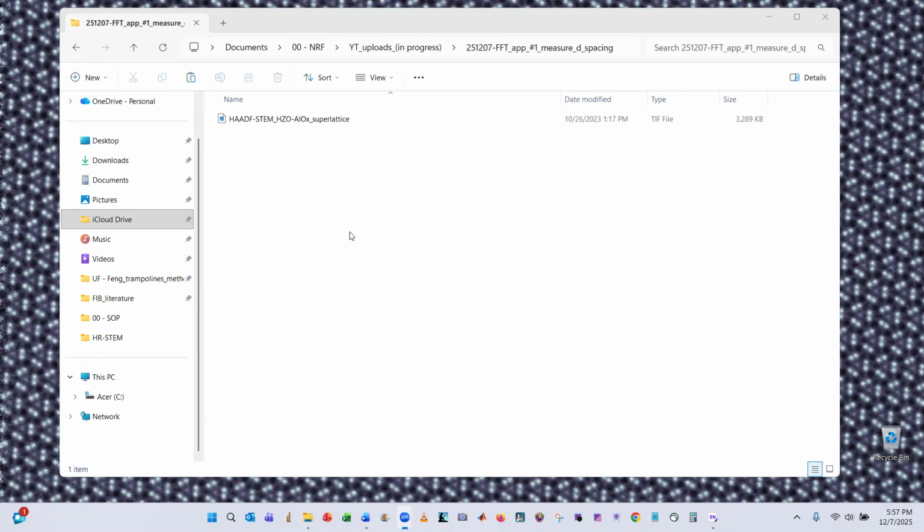So I know ever since I did that video 2 years ago about STEM and the Fast Fourier Transform, there have been a constant barrage of requests for part two. So what I decided to do for part two, which is applications, instead of doing one whole video, I'm going to break this up into chunks.